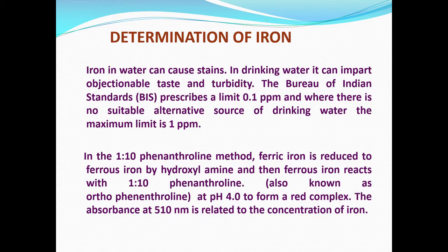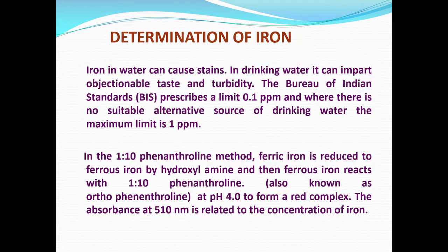Now, we will move on to the interferences. In interferences, normally what we would like to look at, as I have told you, are a number of elements, and since I am not going to present it to you here, I would like you to record the interferences of different elements, that is lithium, boron, magnesium, calcium, copper, cobalt, manganese. All these ions do not interfere.